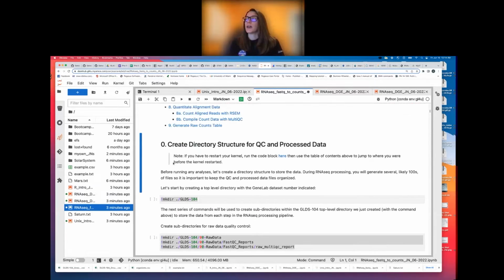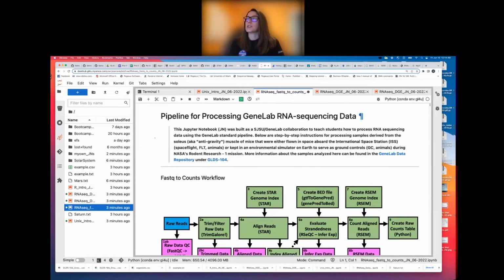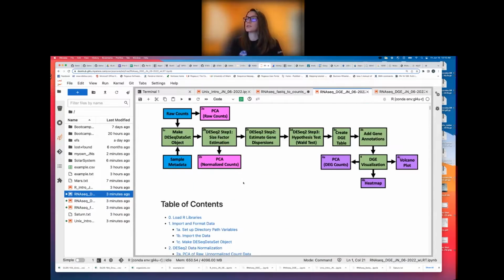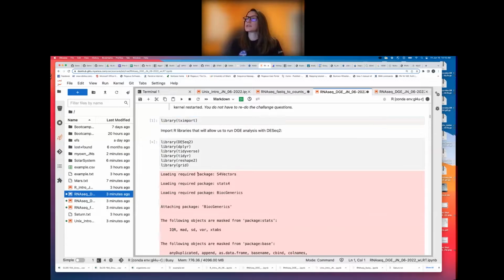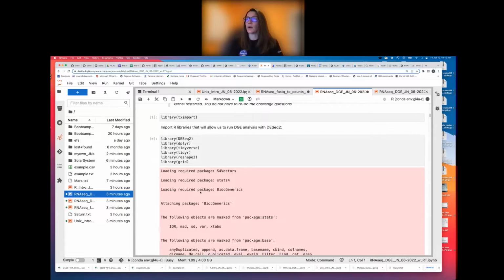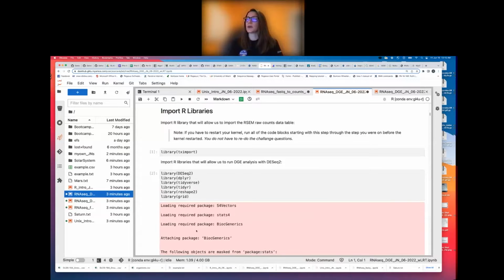So go ahead and do that for all of your notebooks that you've made changes for. So I'll just show you one more time here. Just looking at another one, let me make some outputs here. This has some outputs. So again, just to show you what it looks like, if you have outputs, you will see those outputs on your screen.